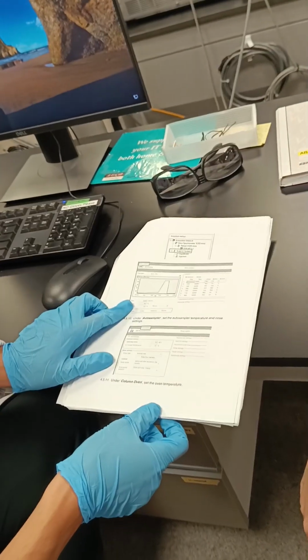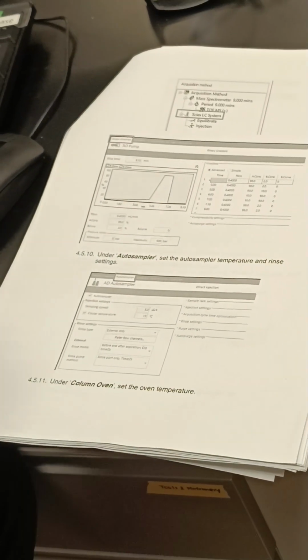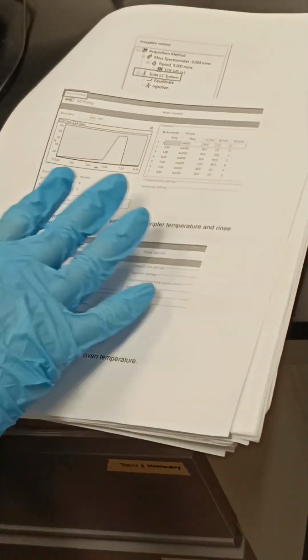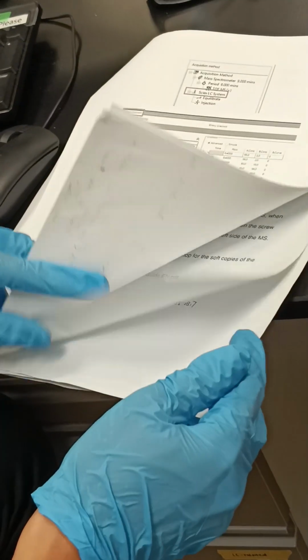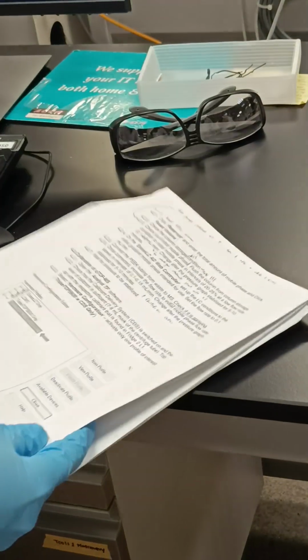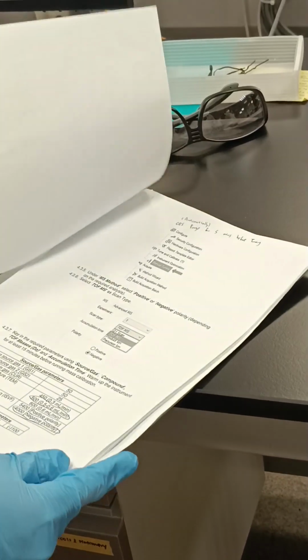I assume you guys have your own protocol as well, because we are dealing with metabolites, so it might be a bit different setup. What I can do the most is guide you through how to flush the system, and how to adjust it to the parameter settings that we desire to make sure the experiment can run smoothly.